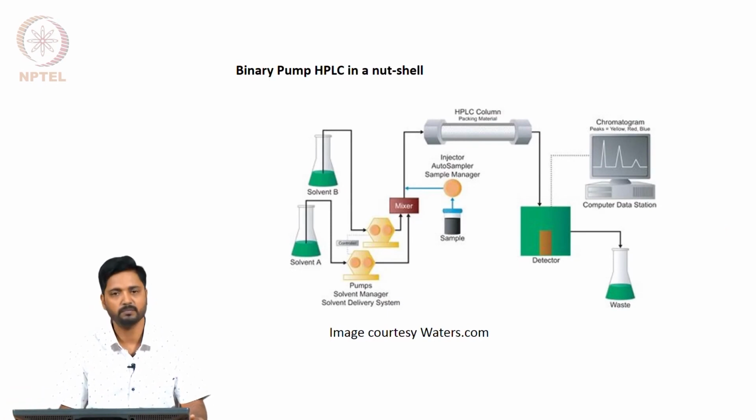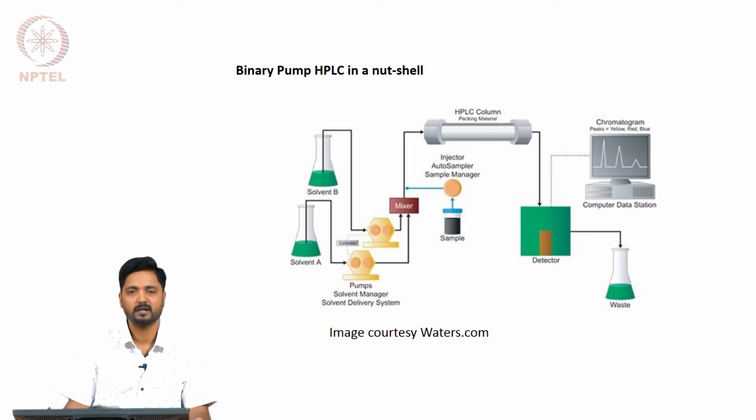In the next slide, let us look at how the binary pump HPLC works, and this image has been taken from the website of waters.com, and what we have are two pumps in a binary system.